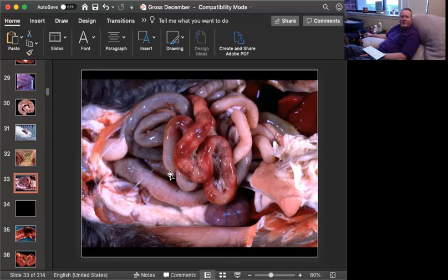What I want you to see is this fibrin that is sort of gumming everything up. And in the lesser affected areas, there's a very thin layer of fibrin that looks like ground glass. See, this is a nice, I'm not going to say it's healthy, but it's probably the large intestine. And panleukopenia doesn't really like the large intestine. It stays restricted to the small intestine. But look at this. It's nice and shiny and smooth. And then you look at this part, and it has this ground glass appearance. It's not shiny. It's just this fine fibrin. Then when you get to the area that's really affected, it has these long strands of fibrin gumming it up.